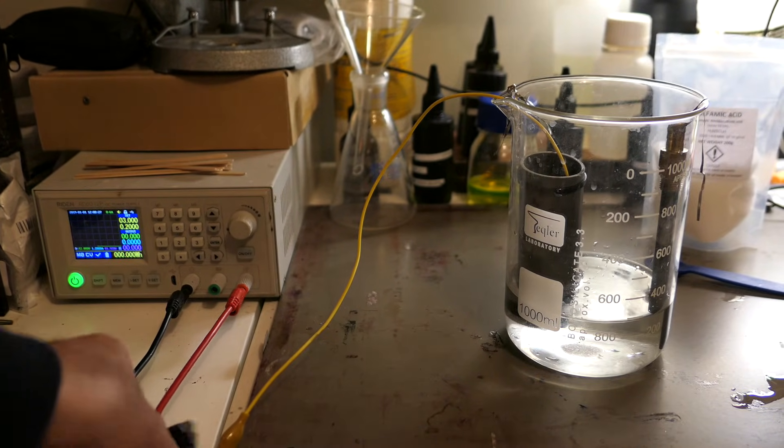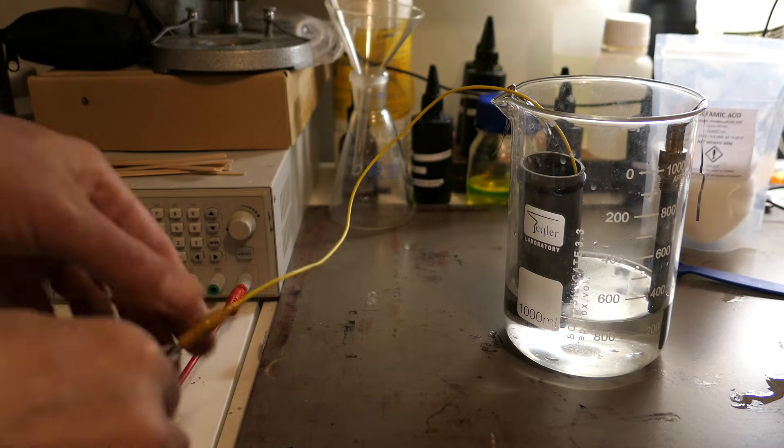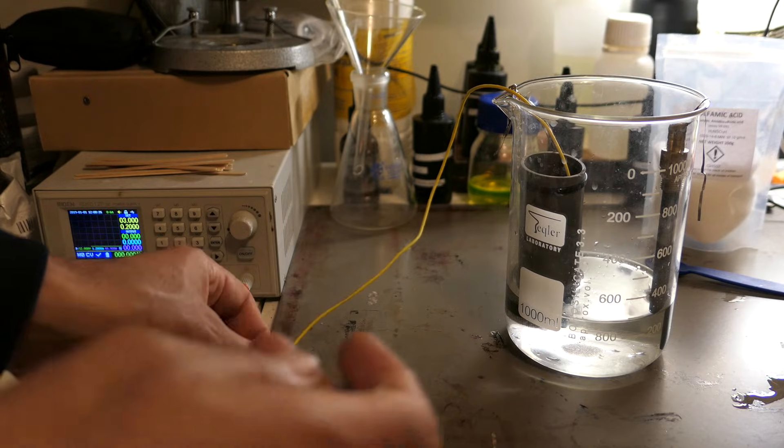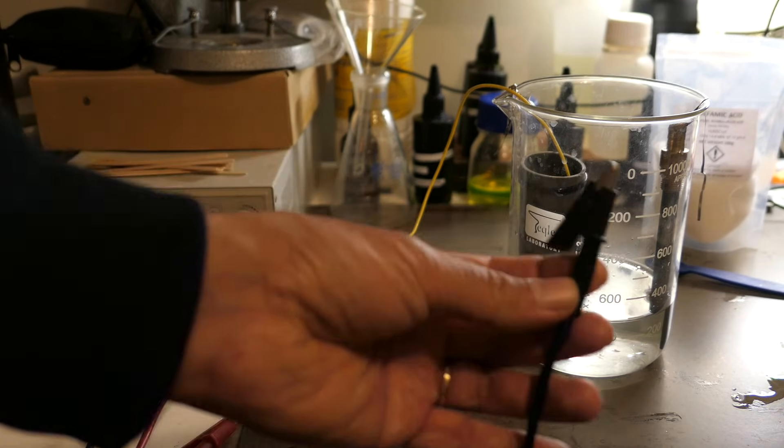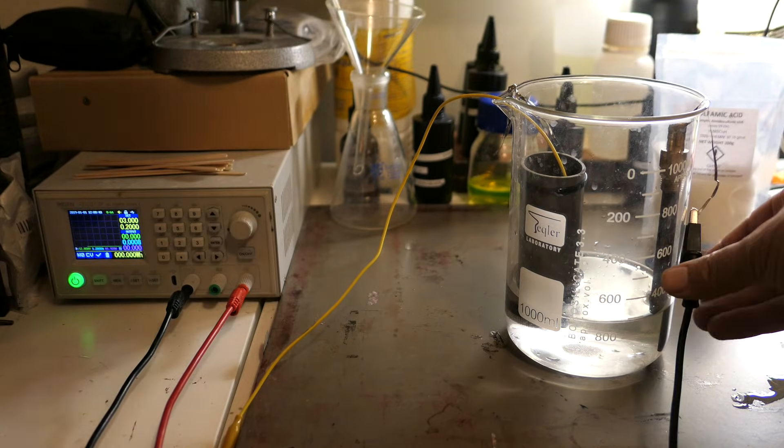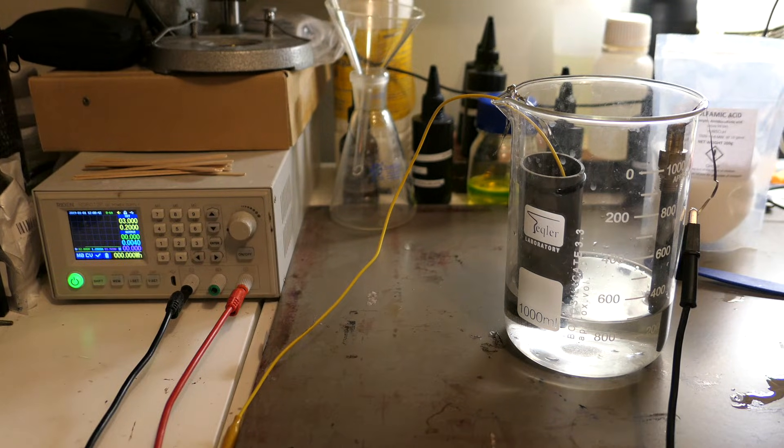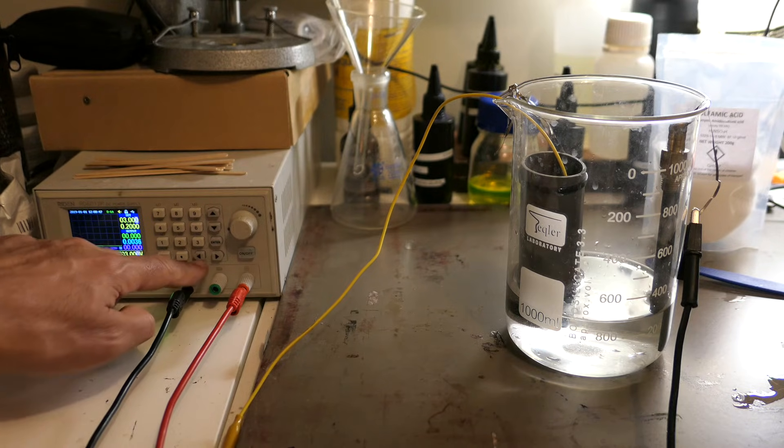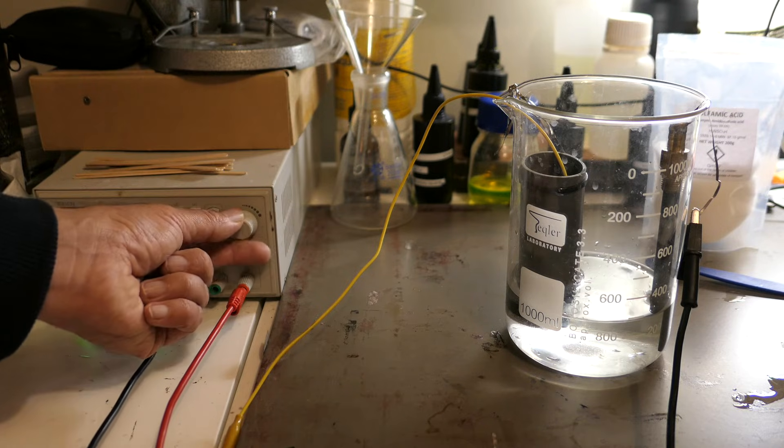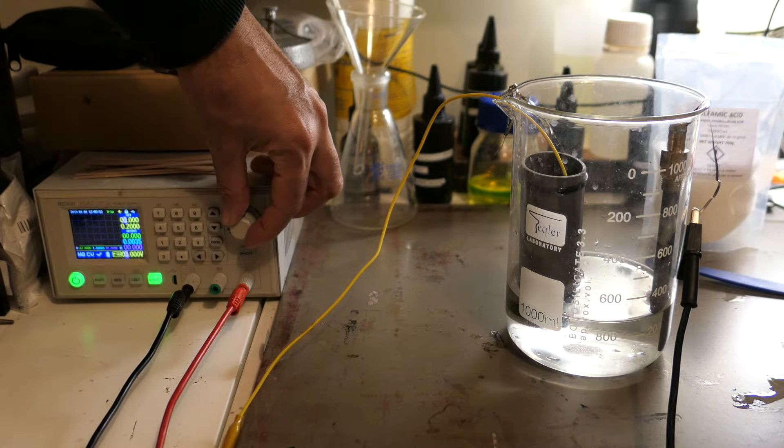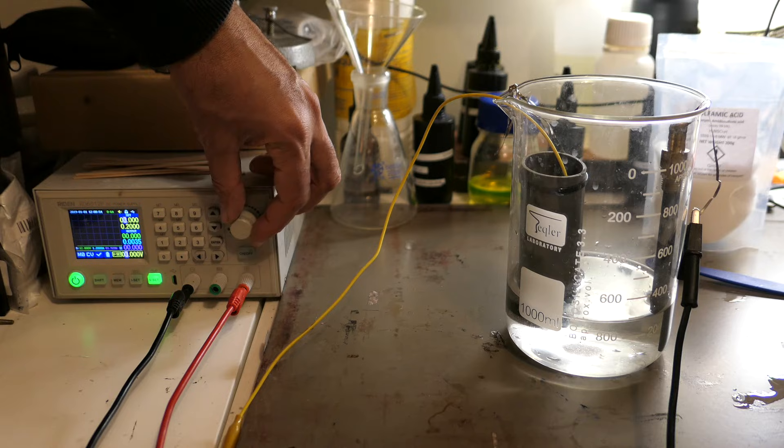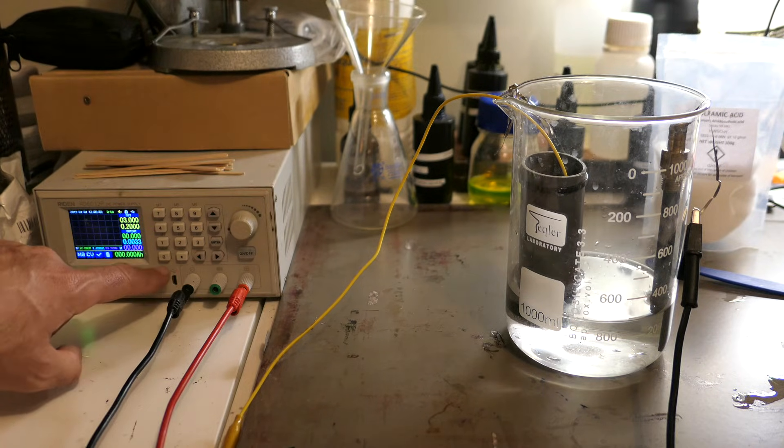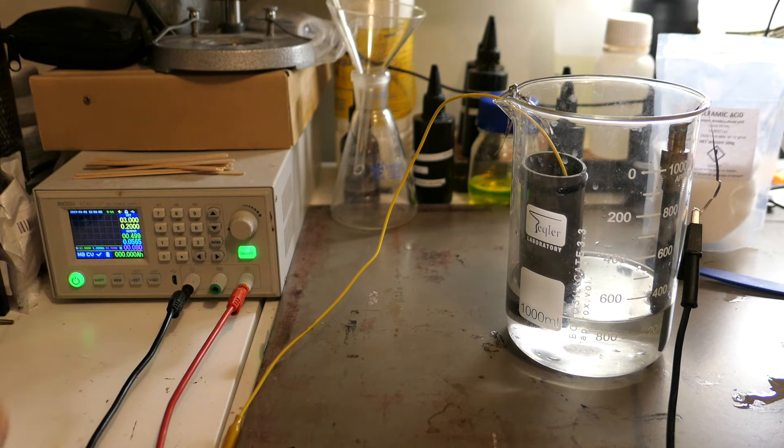For the cathode, we're using a simple graphite bar. Graphite is a great choice for this process because it's inert, meaning it won't react with the electrolyte or the silver we're refining. I've also set my power supply to 3 volts, which is a safe and effective voltage for silver refining. I have limited the current as well, to avoid any issues like a short circuit that could cause problems during the process. Keeping the current under control ensures that the electrolysis runs smoothly without overheating or damaging the equipment.